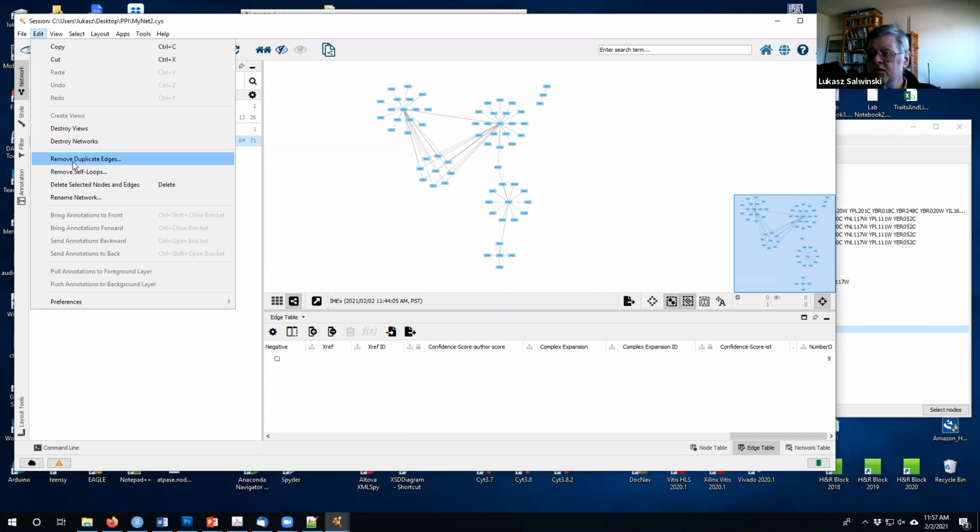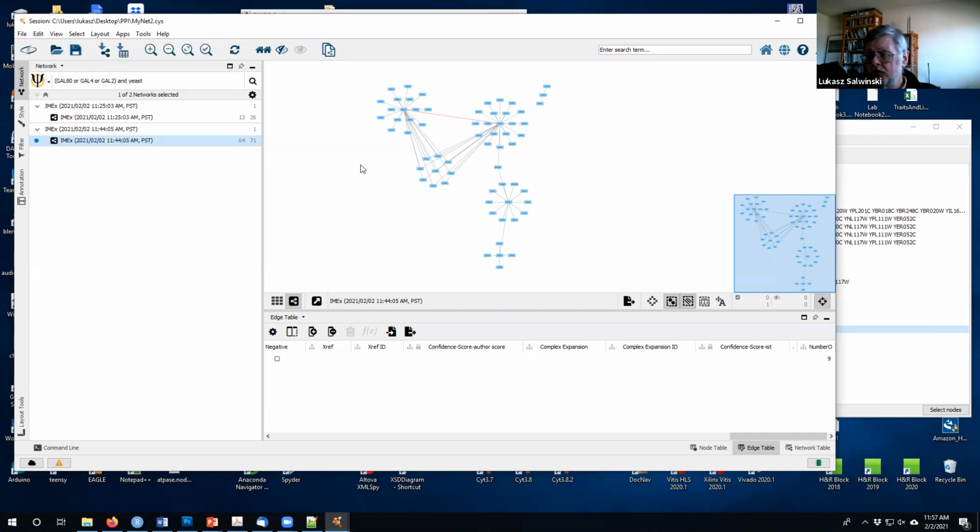It depends on the application, and it requires a little bit of thinking, in the sense that we've got to know what type of interactions we're trying to look at, and how to handle those things.